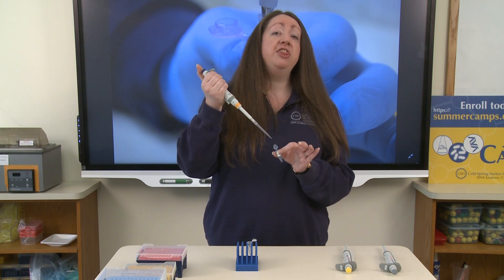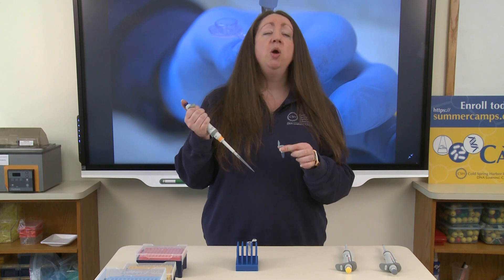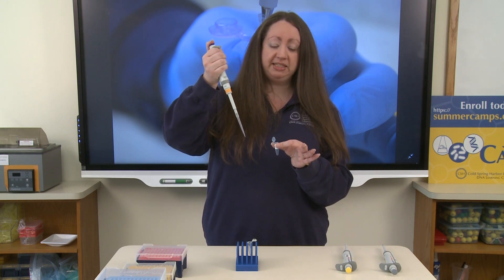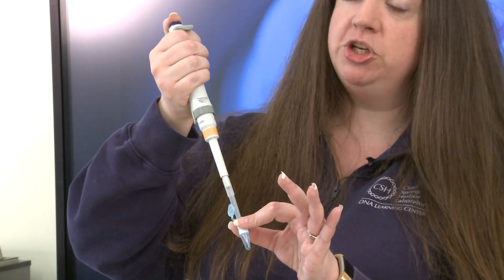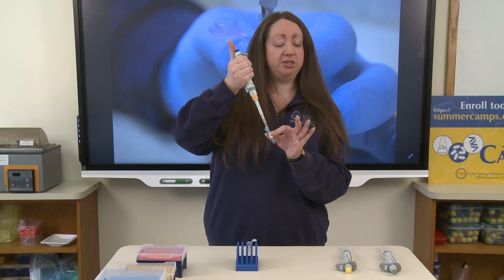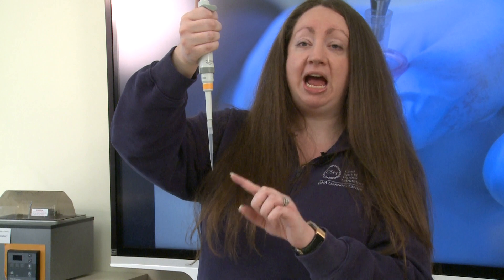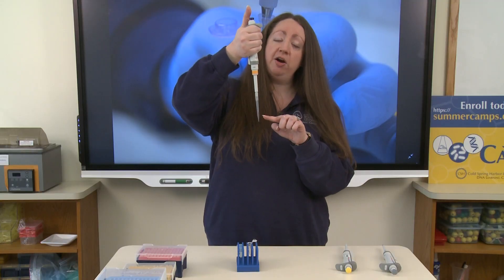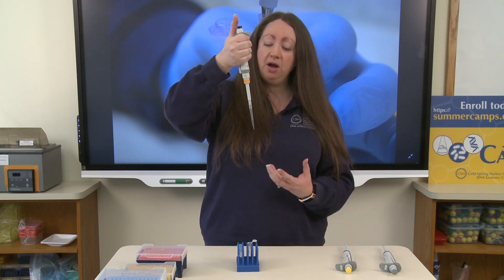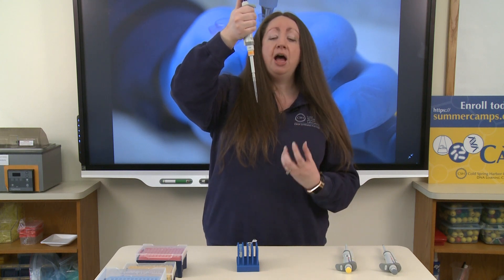If you place the tip into the liquid and then press the plunger down, you will push air into the tube, causing air bubbles to form inside your solution, which may prevent you from drawing up the correct volume. So press to the first stop before placing the tip into the tube. Place the tip into the solution, then slowly raise your thumb off the plunger to draw the solution up. Pull the pipette tip straight up and out of the tube. Always check to make sure you have the correct volume — if you see air bubbles inside, you have drawn up less than 250 microliters, as those bubbles replace the volume of liquid.